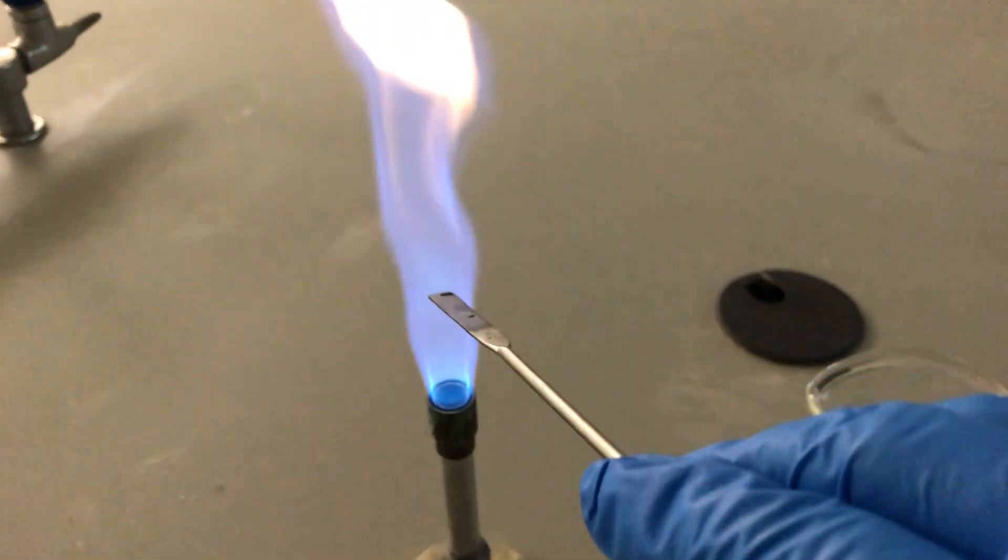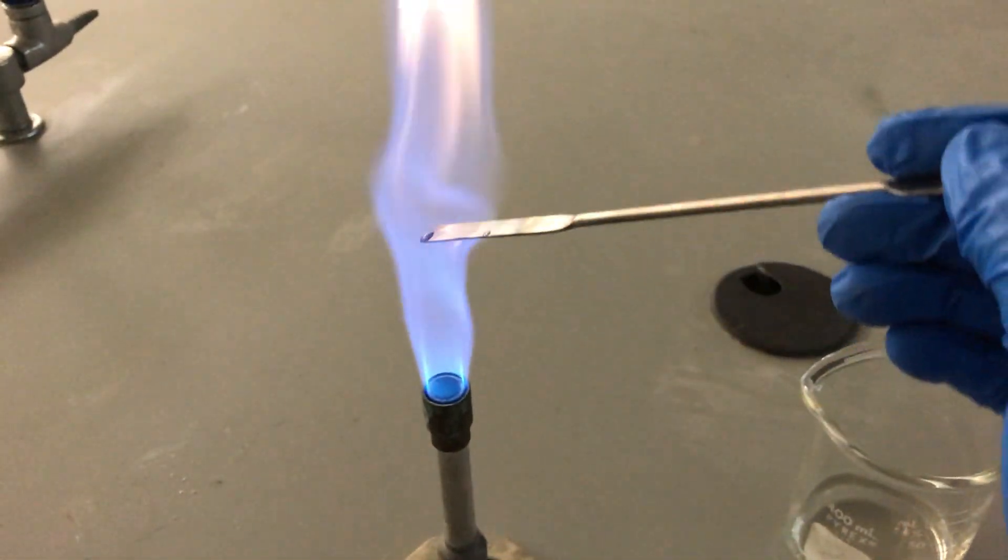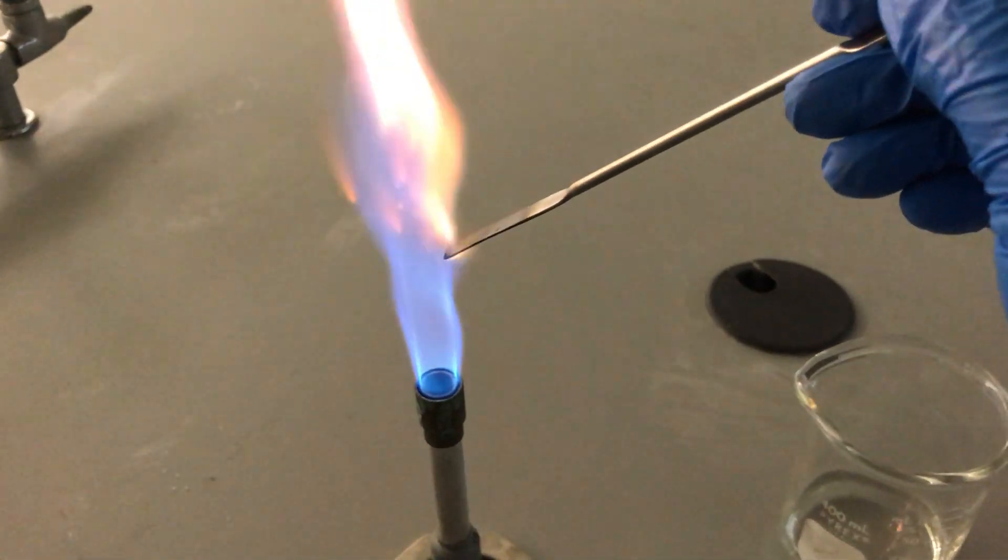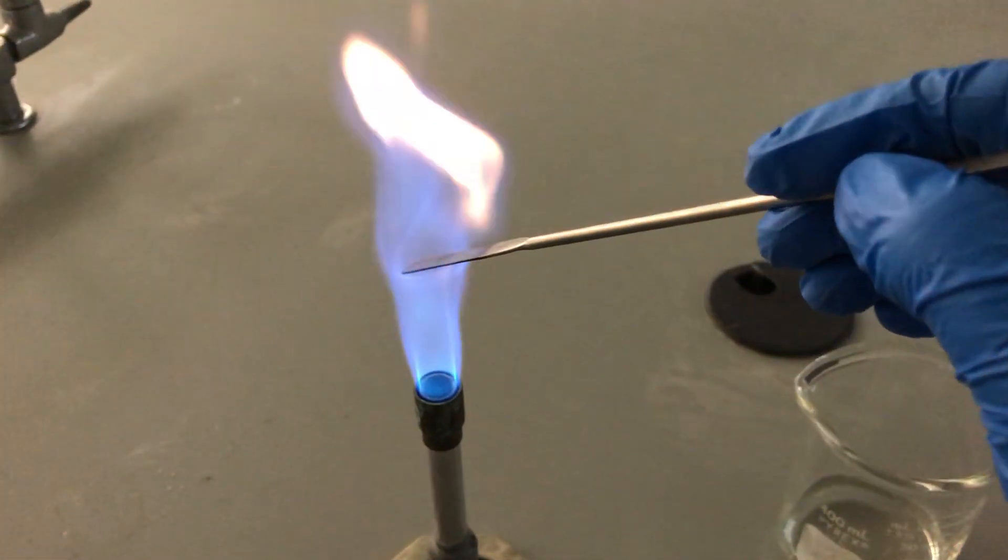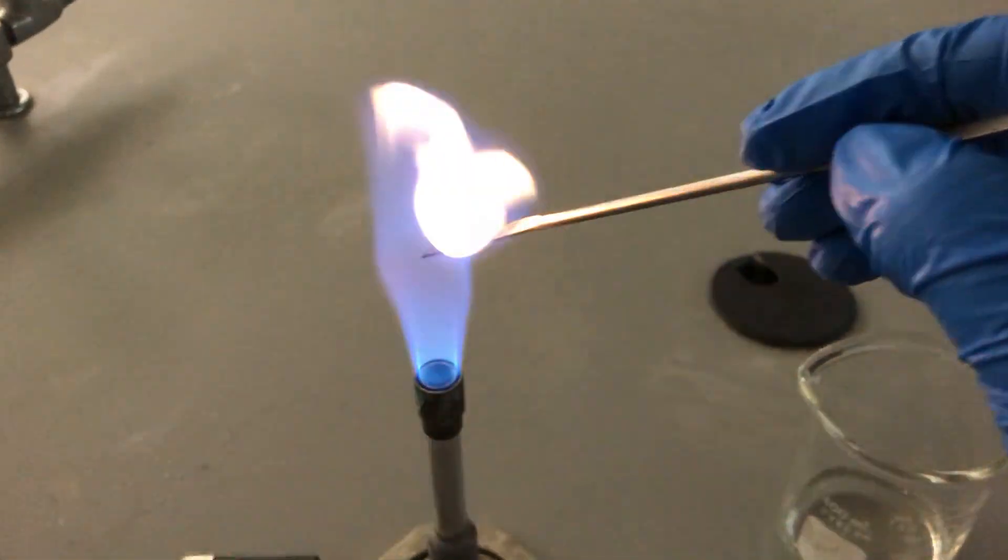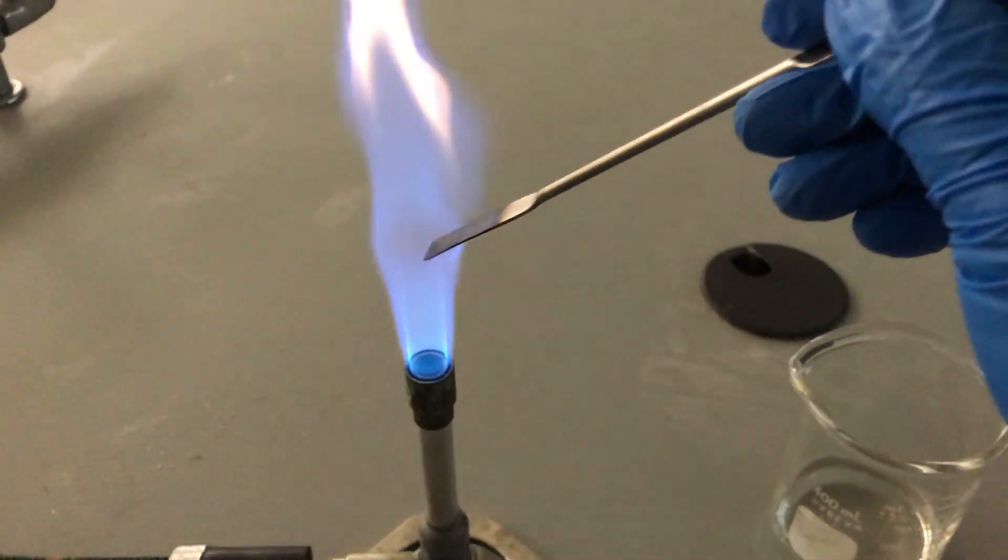So by doing this we make sure that any compounds that might be clinging to the spatula are removed. You can see it's kind of burning with some different colored flames, so that means we're removing some impurities and some contaminating compounds.